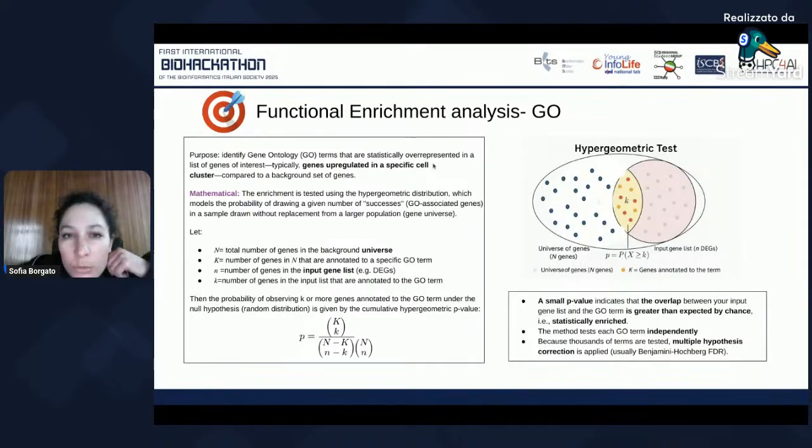So thanks to differential expression analysis, we have this ranked gene list. We can set some threshold, based on log-fold change or on the number of markers we want to take into account, and select a subset of genes.